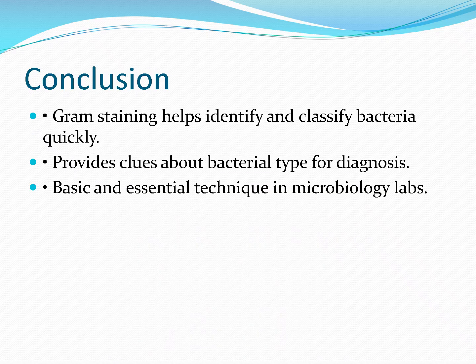Finally, the conclusion. Gram staining helps identify and classify bacteria quickly. It provides clues about bacterial type for diagnosis. It is a basic and essential technique in microbiology labs.